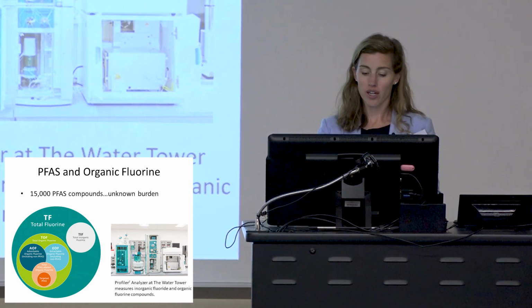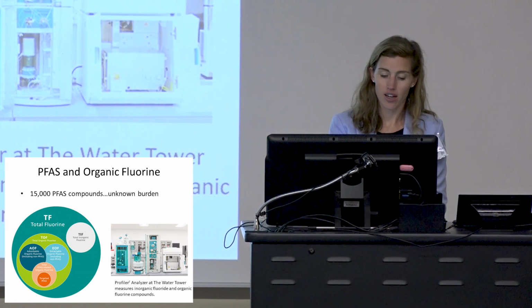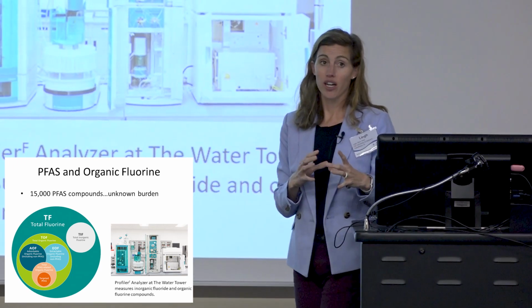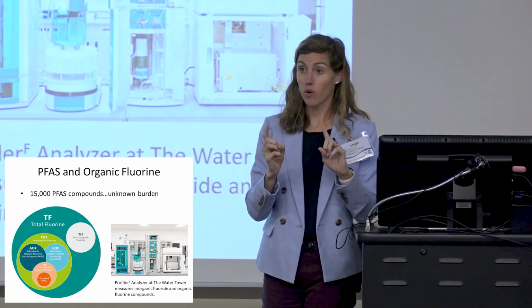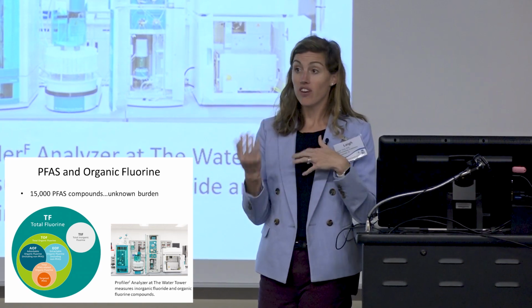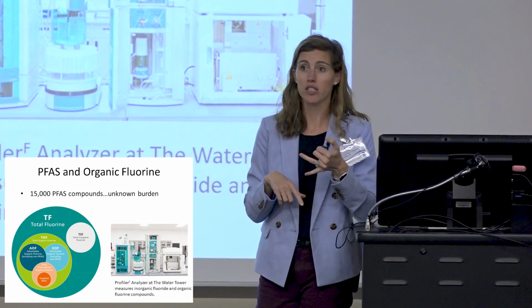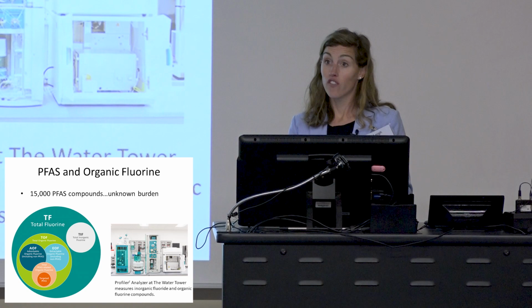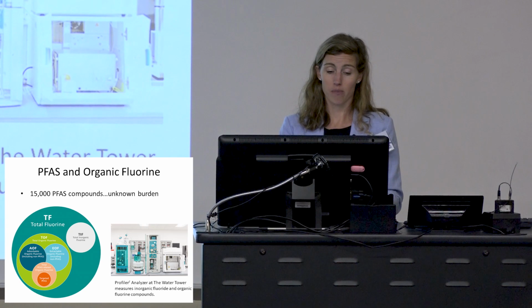If you have total fluorine, you can break it down into inorganic fluorine and total organic fluorine. Total organic fluorine are going to be PFAS-related organic fluorine bonds and non-PFAS related. That organic fluorine, carbon to fluorine bond, is very rarely going to be just naturally occurring. So it'll be PFAS impacted, or it'll be non-PFAS like pharmaceuticals, personal care products. So it can give us some insight into the pharmaceuticals, personal care products that are in the water, but it's not a specific detection.